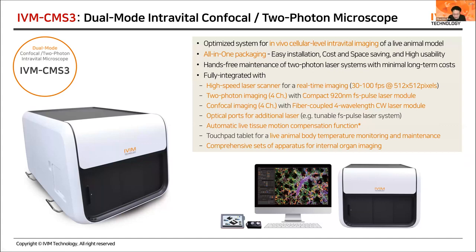You need to learn how to handle the animal for the first time, and that will take several weeks. The microscope itself is quite easy to use, almost everything is automated with single button operations. So I would say several weeks.